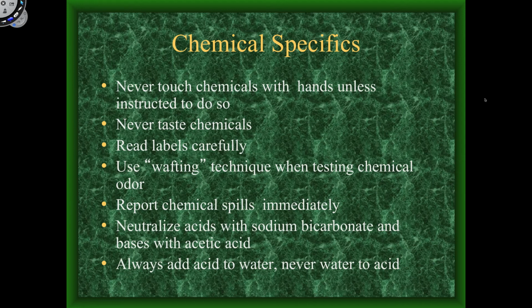Also, when you're mixing acids, diluting them, we'll get more into that when we talk about solutions, but for right now, just understand that when you are trying to mix acids with water, you always add the acid to the water, never water to the acid. The reason for that is, if you add water to concentrated acid, the acid tends to get very hot very fast. It reacts with the water and can sometimes boil, which can cause it to spatter. And anything spattering, if it's a little bit of water and a lot of strong acid, can hurt.